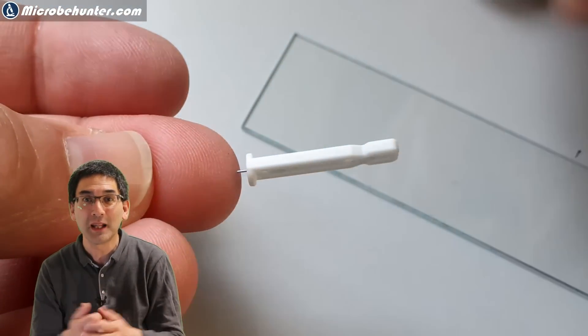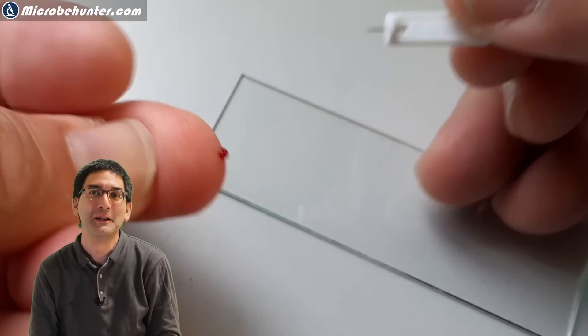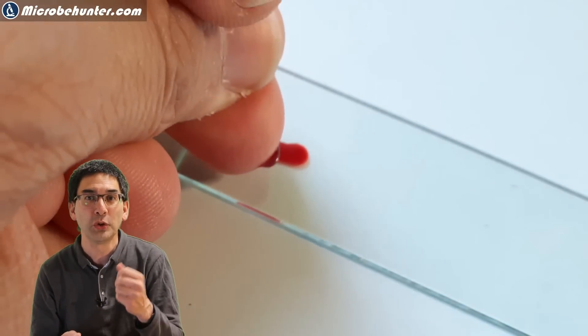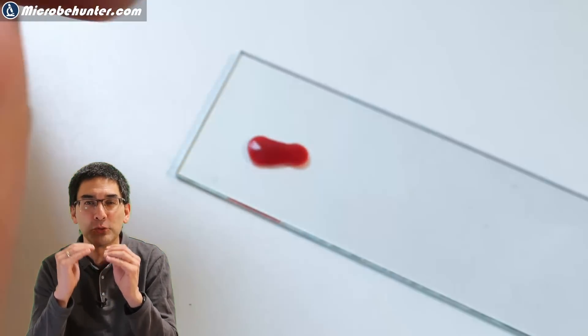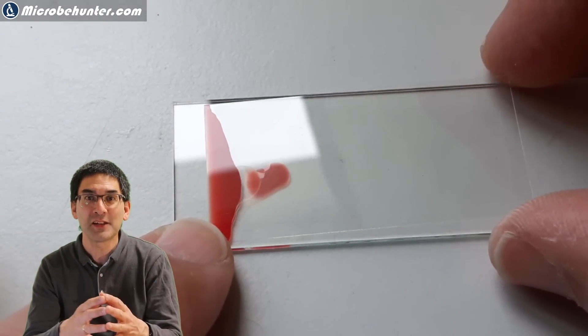Observing them is relatively easy provided that you're brave enough to prick your little finger. A small drop of blood is enough. Do not use too much because the blood film should be very thin. I basically placed the cover glass on it.